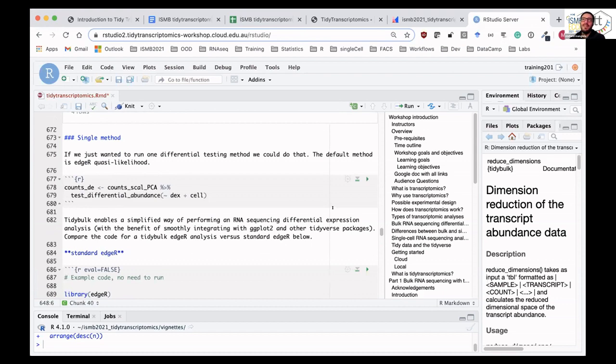I agree. Another simple way is to do filtering. So not go in one, but filter four times for each of the statistics, false discovery rate and so on. And every time ask, filter for false discovery rate less than, and see how many you got. And then you get your results much simpler. Yeah, that's probably how I would do it. That was Stefano's solution. But whichever way it suits you, feel free to use.